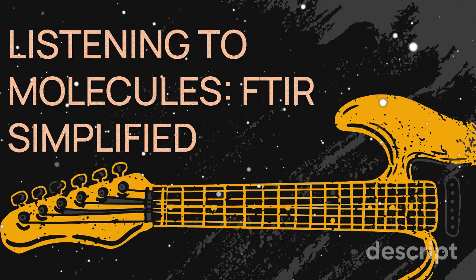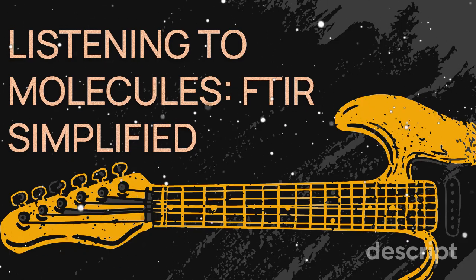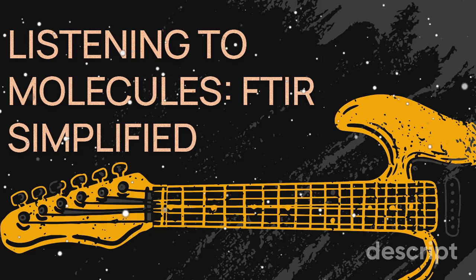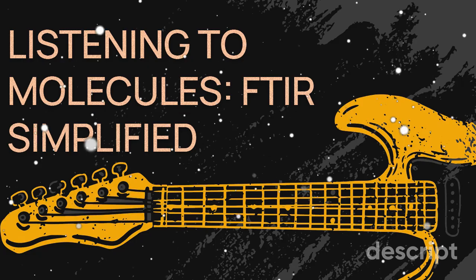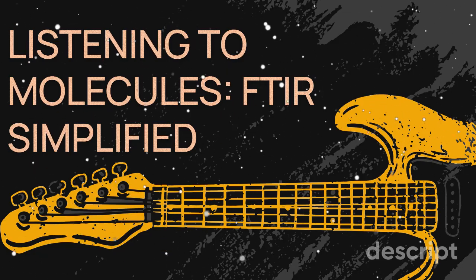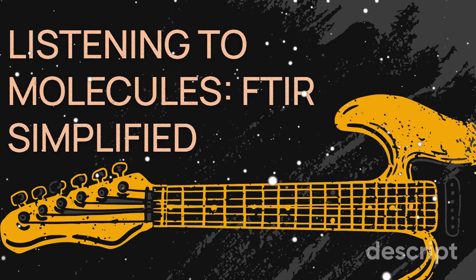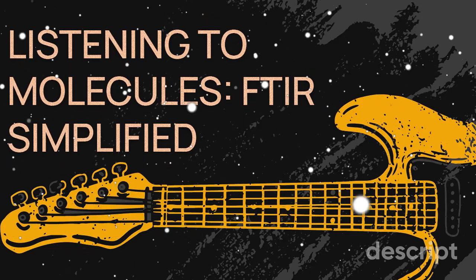So think about it this way. Each musical note has a specific frequency. Well, molecules vibrate at specific frequencies too. And FTIR uses infrared light to analyze those vibrations. That's really remarkable. When infrared light hits a molecule, some of it gets absorbed at specific frequencies depending on the molecule's structure. It's like each molecule has its own unique set of frequencies where it resonates.